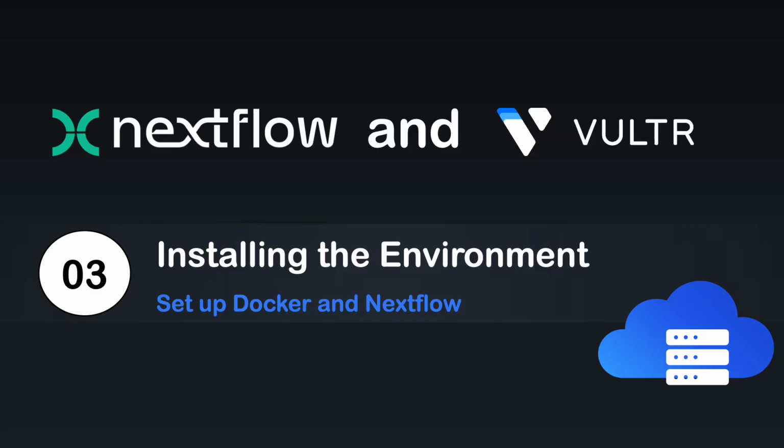Hey everyone, welcome back. In this video, we'll set up our server by installing Java, Nextflow, and Docker so that we can run our bioinformatics pipeline.